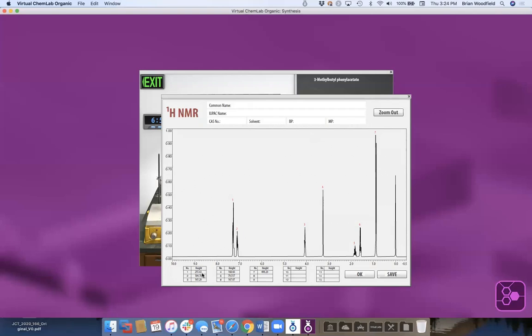And we took the actual areas under the peak, and we created a random number and then made all of these areas relative to some random number. So you take the smallest area, like the 79.507, and divide through, and that would tell you the relative number of protons for each one.